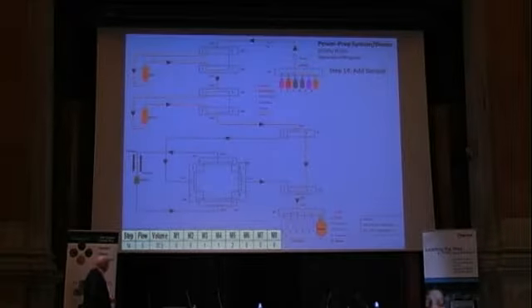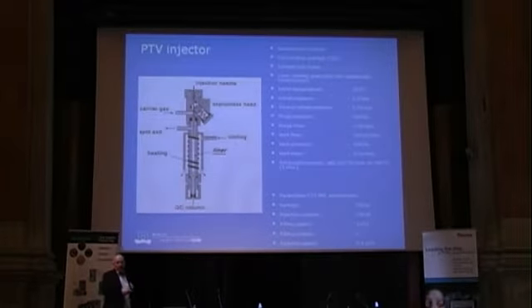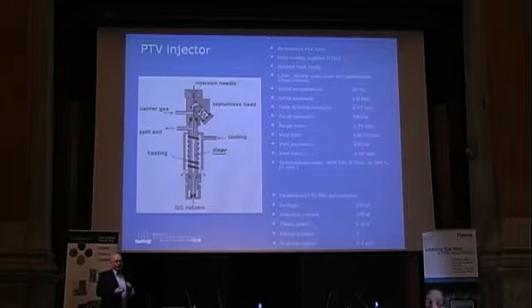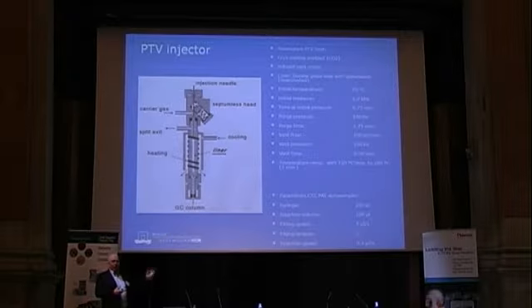Okay. Large volume injection. I'm a big fan of large volume injection. For the pesticides, we use large volume injection just to improve our limits of detection. For the dioxins, we inject the same amount as in the past using splitless injection, but the benefit of this system is in the evaporation. Nowadays, we do the automated evaporation after the sample cleanup. We use the PowerVap from FMS, and it's automatically, unattended, concentrated down to half a milliliter, and then we directly inject from that half a milliliter 100 microliters onto the GC column.